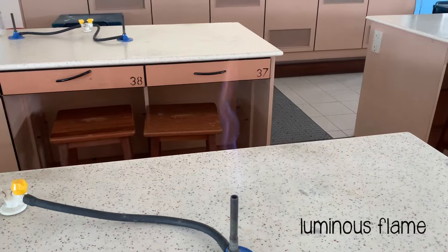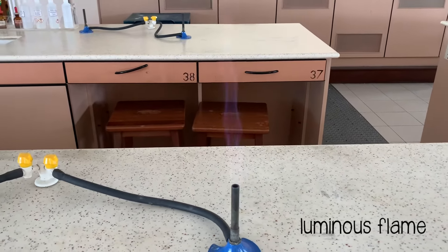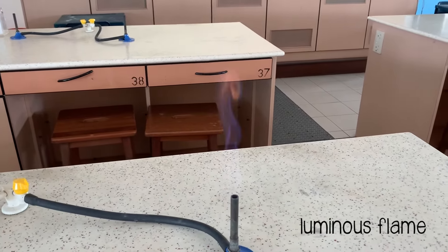We then have a luminous flame. This occurs when the air holes are closed and very little air is allowed to mix with the gas. It is an orange flame that is flickering and unsteady.